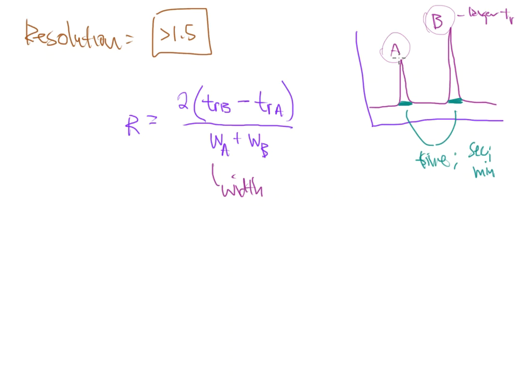And of course, the retention time here, those also will have a matching unit. That will be in time as well, either in seconds or in minutes. And that really is just up to the chromatograph and the chromatographer to report that value, so that way you can use them a little bit later down the road. So the nice thing about these is that everything's got to be given to you.